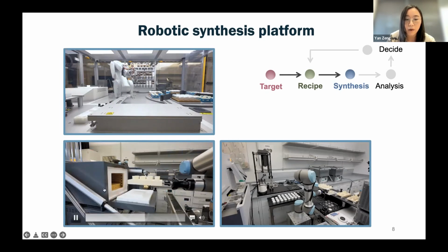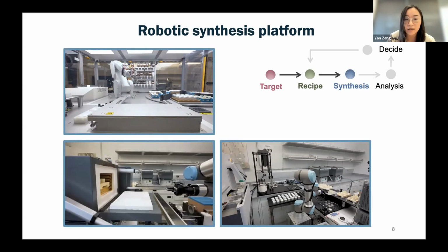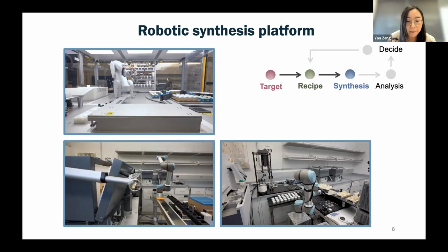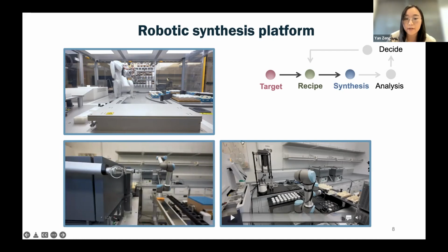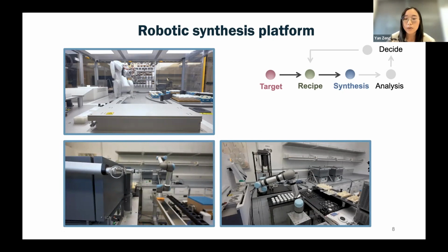It can either be these box furnaces that perform synthesis in air. Each furnace can hold up to 8 crucibles. Or it can go to the furnace on the floor in the right corner that can perform synthesis under controlled atmosphere. This is especially important if we want to synthesize, for example, cathode or anode materials. So after the heating step, the last step is to retrieve the powder or the solid from the crucible and prepare it for the XRD and SEM.